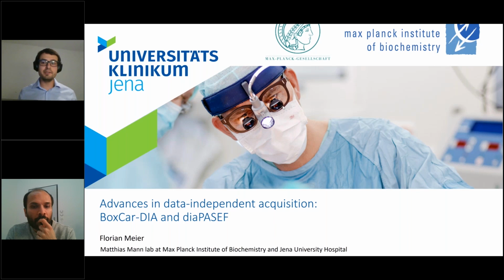There's basically an unlimited number of ways how you could define these boxes in this 2D space, which you use to select the precursors, because now we place these boxes not only in m/z, but also in the ion mobility. And I think there are certainly different schemes that one could test, and maybe some of them provide better performance than what we have right now. But it already works very well, I would say, for starting out methods.